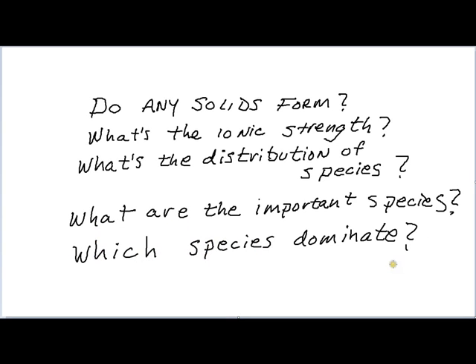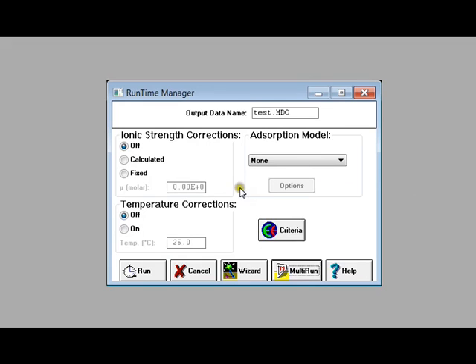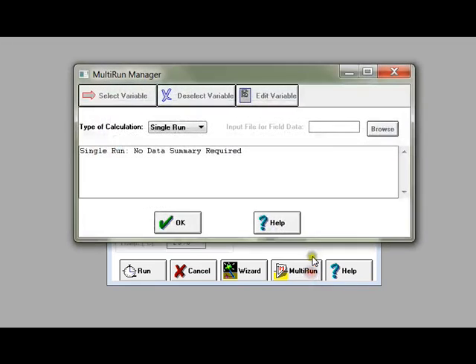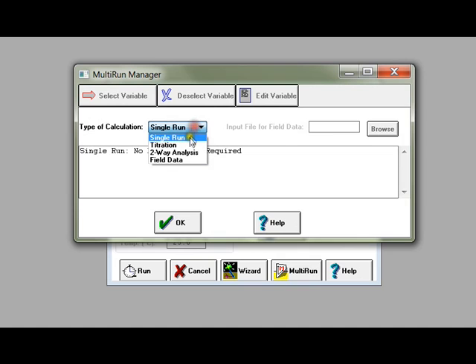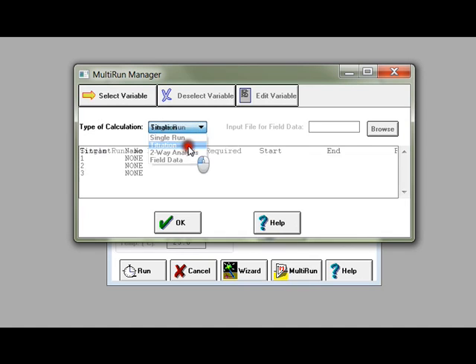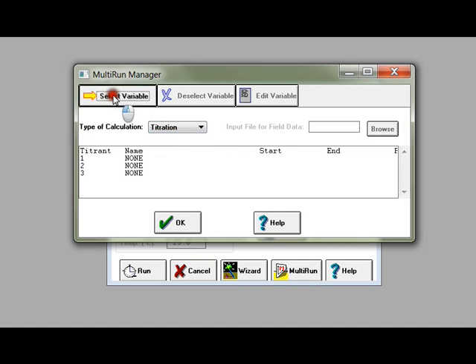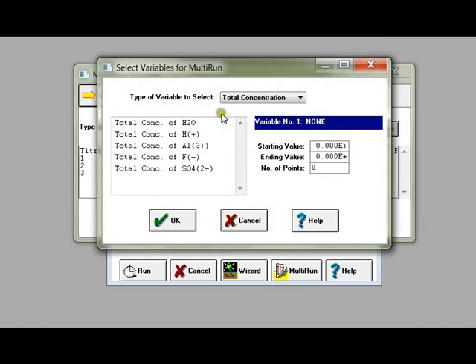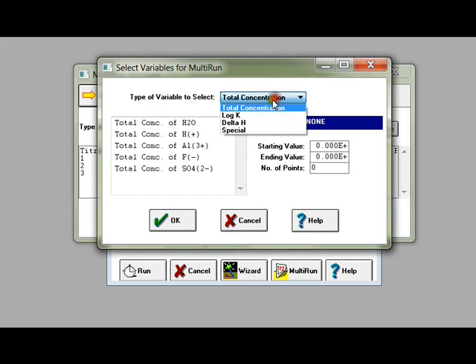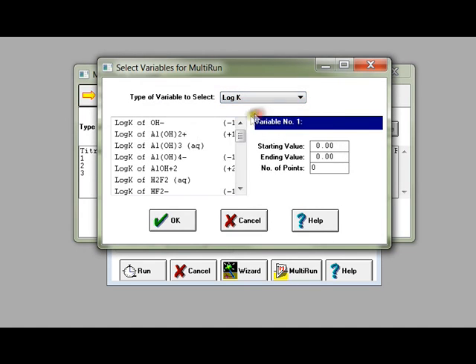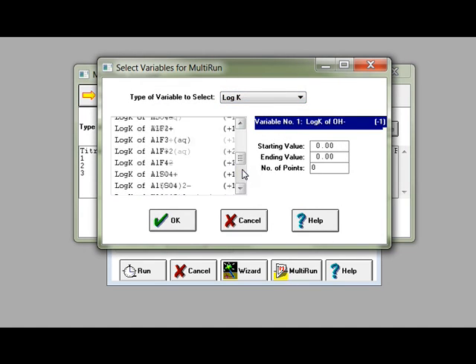And what if I want to know about the system over a range of pH? Go to the multi-run manager, select titration as the type of calculation, then press the select variable button. Under the type of variable to select, choose log K, then select the log K of pH.